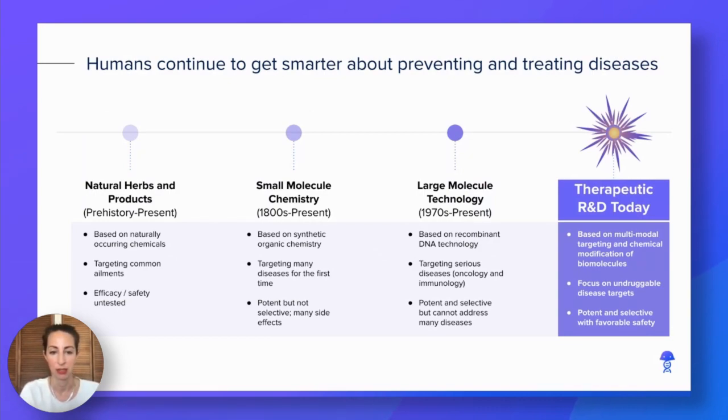The history of biopharmaceuticals is long and yet also rapidly accelerating. Today, modalities are not confined to traditional categorizations as we enter a new era of science where it's no longer just small molecule or antibodies. This opens up territory for targeting previously undruggable diseases, which is a massive opportunity for humanity.